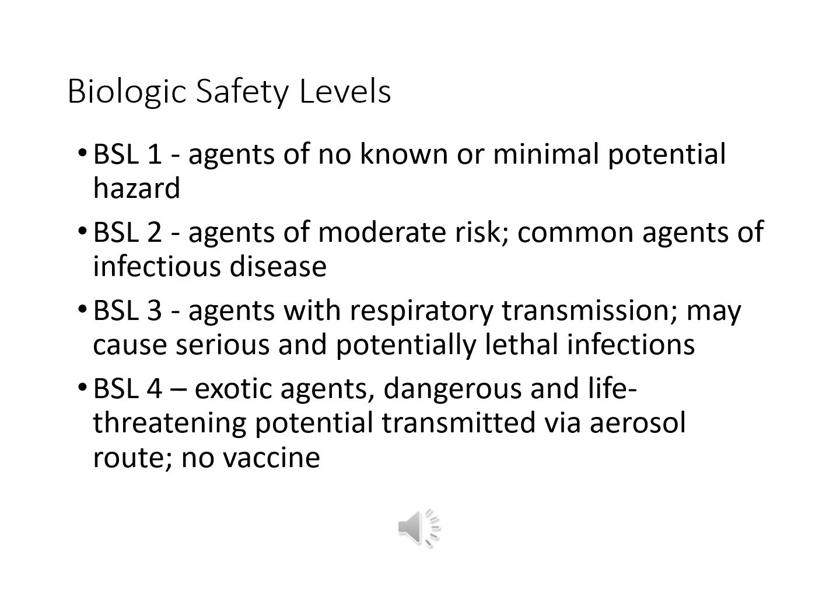BSL level 3 are agents with respiratory transmission. Generally I think of tuberculosis when I hear respiratory, and these may cause potentially serious, lethal infections.